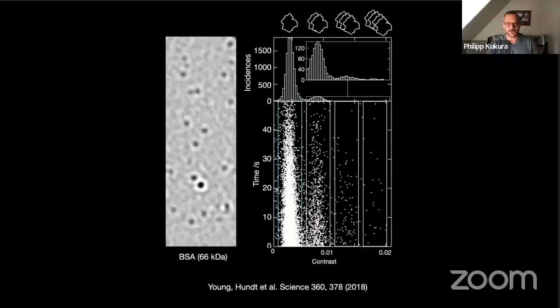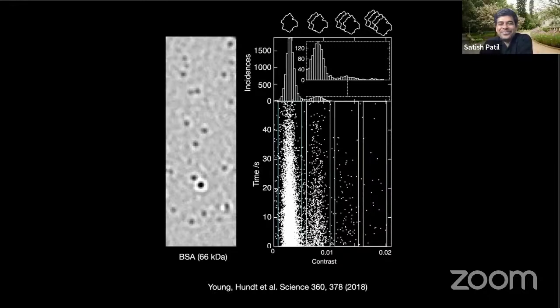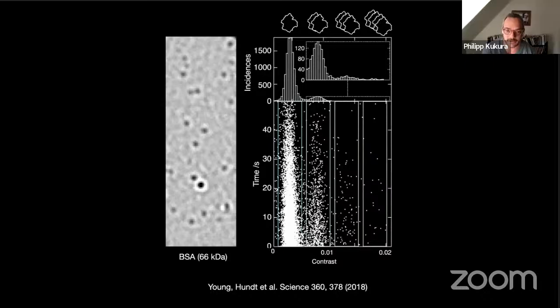So we've done some exploratory experiments in that regard, but then there is also the reality that you only have a research group of a certain size, and you have certain collaborators around you. There's only so much you can do efficiently. But we have looked at the output of polymerization reactions, and we can actually see how the polydispersity changes as a function of reaction time. And this is all happening, but as always with collaboration, it requires a certain impetus, and we're not quite there yet. But you're absolutely right. That's certainly one of the things that we could do.